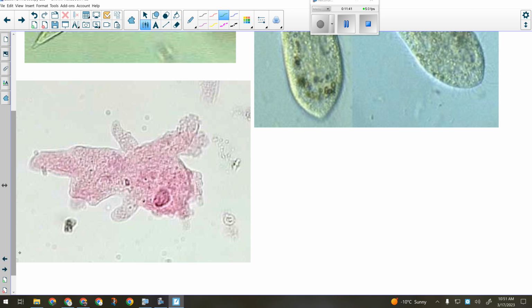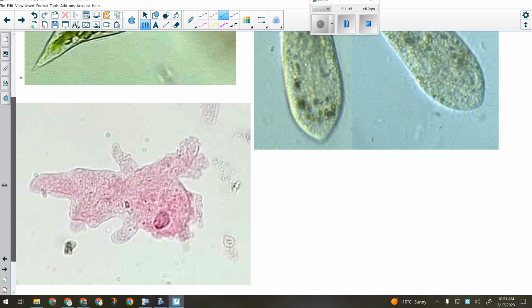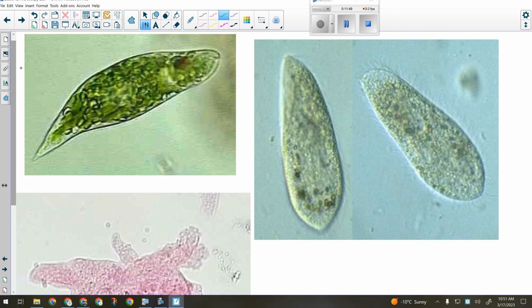And then you'll take the amoeba slide out, put it back in the container, and you'll grab the paramecium. The paramecium looks like this, okay? Kind of an oval shape. And if you get them really well focused on high power for these ones, because they're smaller, you might even see these little hair-like extensions that come out of the outside called cilia. Okay, if you get those, you did an excellent job of focusing your paramecium. Okay, take a picture of that on high power, and then put that slide back.